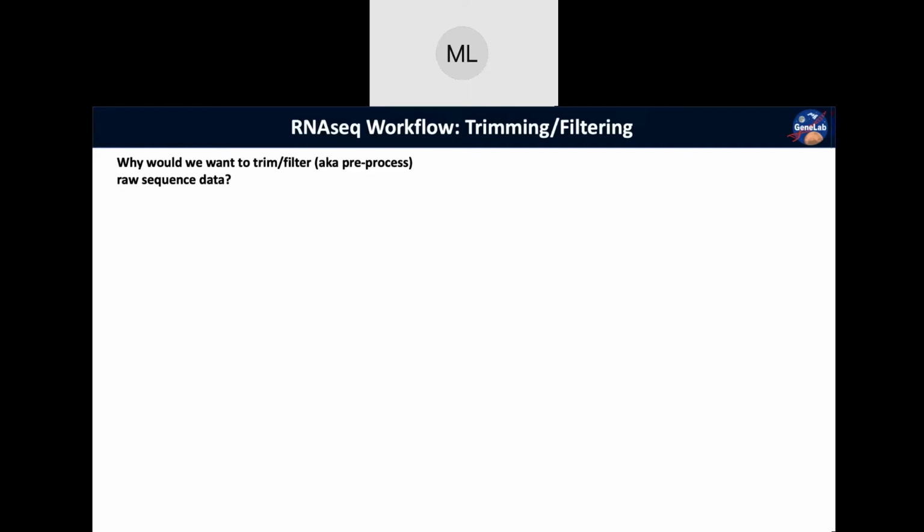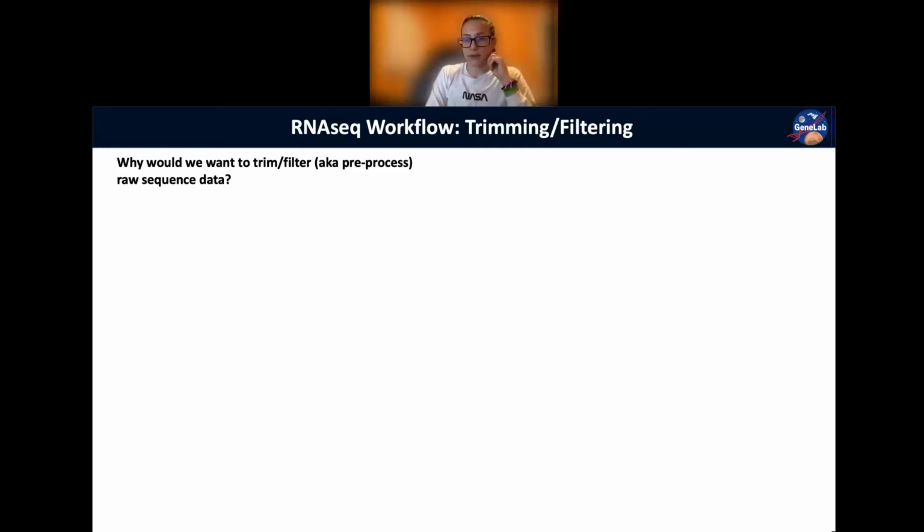So it's slightly different than what we're doing here, but that makes sense for doing phylogenetics like that. But that's after you build your genomes, right? So after you do your assembly to identify which organisms are there.